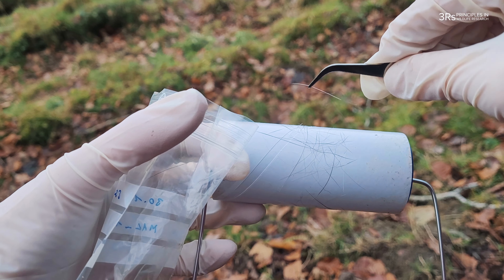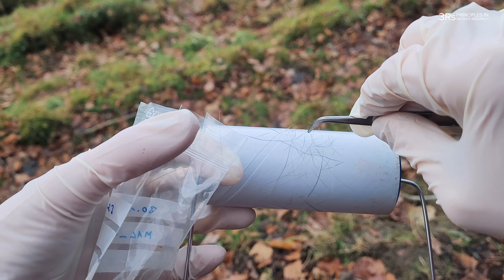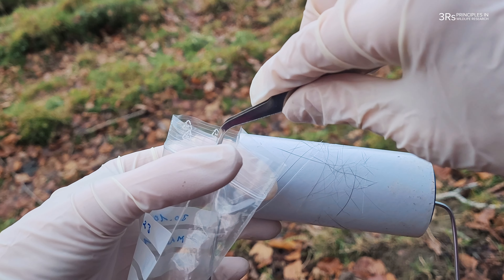Using clean forceps, collect the hair and place it in a labelled bag or a sampling tube, and store it at minus 20 degrees Celsius until further analysis.